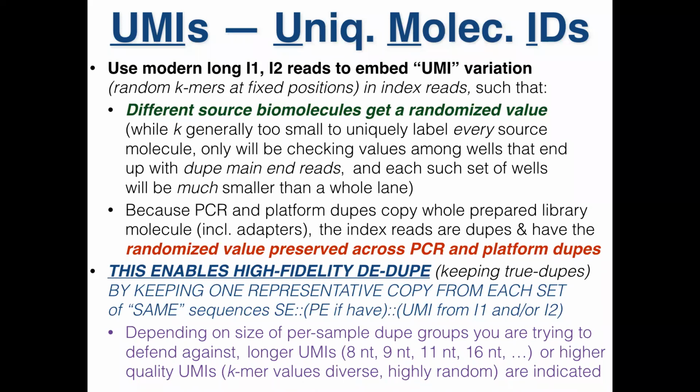They just need the property that duplicates keep the same UMI, which will be true, and that ones from independent molecules have a high probability of being different. As long as the biases aren't crazy, they will do the job. Furthermore, they degrade gracefully. In the worst case, if the UMI completely fails and every read calls the same UMI sequence, you're just back to the situation you were in before. They start there and do better.